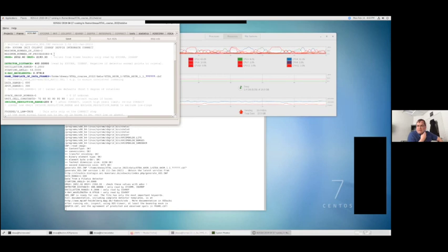Okay, and I see Edwin had a chat question. How often do you need to adjust trusted region, and is it something you need to consider for every data set? Usually this is something that people just have a default that they go to.